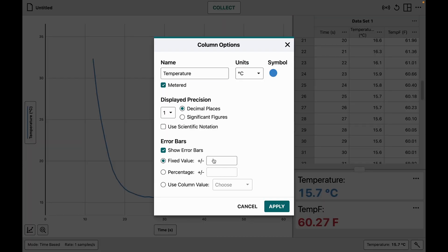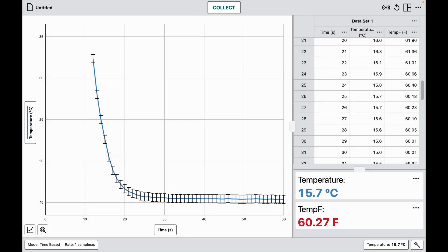I can choose a fixed value — for example, for a temperature probe, 0.5 degrees Celsius plus or minus — or I can use a percentage, or I can use a column if I know each point has a specific error relationship. I choose apply and get my error bars added to the graph.